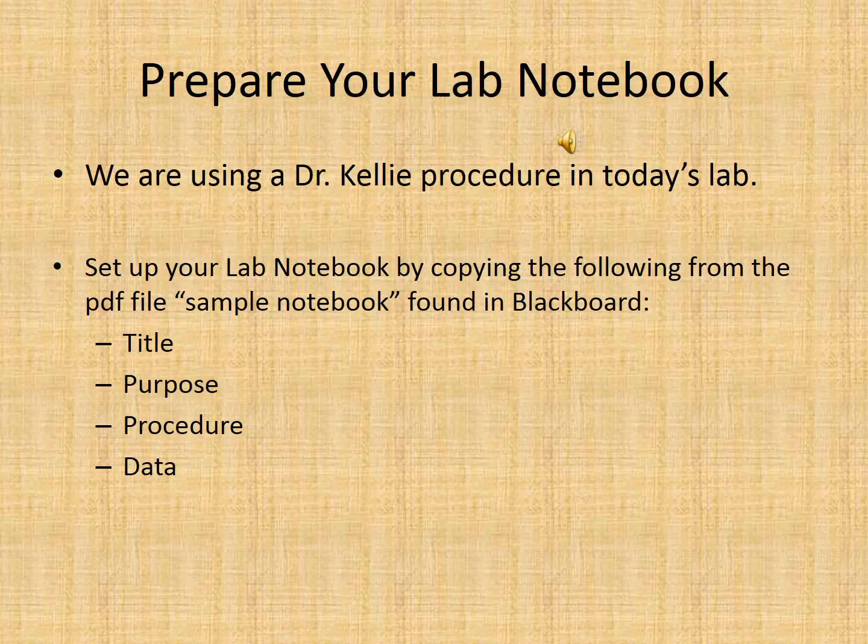Prepare your lab notebook for this lab. We're using a Dr. Kelly procedure today. So you'll need to prepare your lab notebook exactly as shown in the attached PDF file. You'll find the attached PDF file called Sample Notebook in Blackboard. It's the same handout we saw when we discussed the lab notebook. We're going to use that procedure.